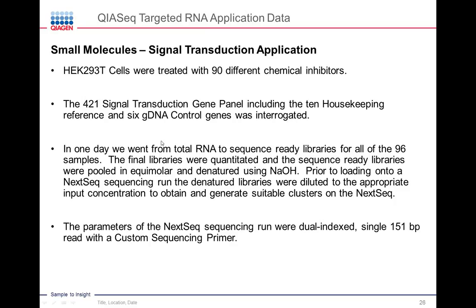And in one day, we went again from RNA to sequencing ready libraries, because it takes simply 6 hours to go from RNA to libraries that are ready to be quantified and sequenced. We were able to go from total RNA isolated all the way to sequencing ready libraries in one day.